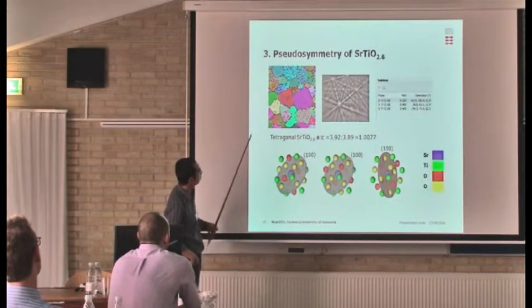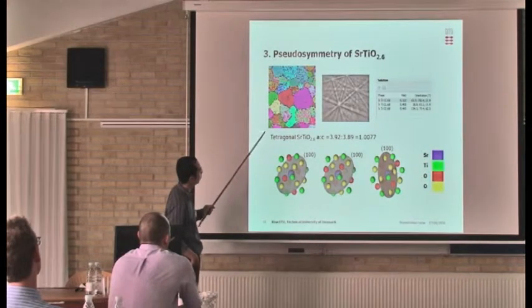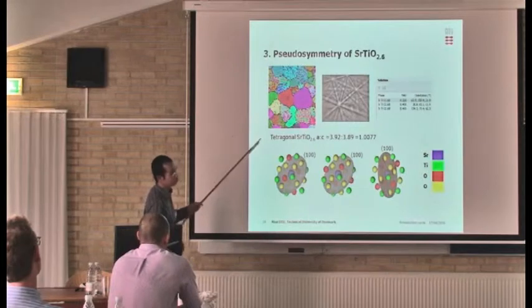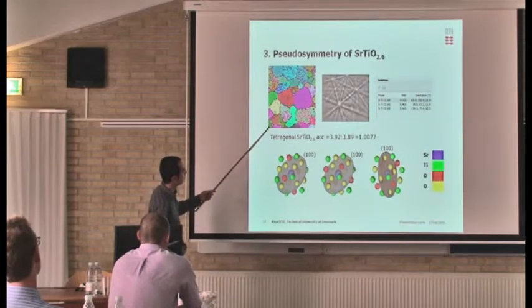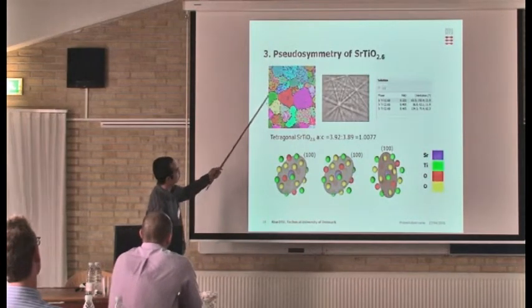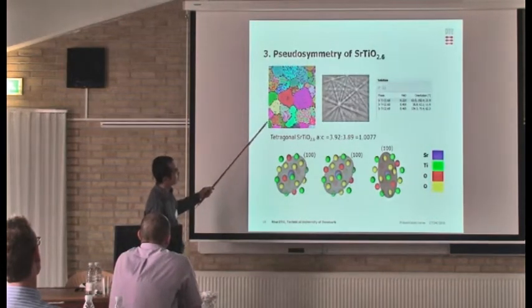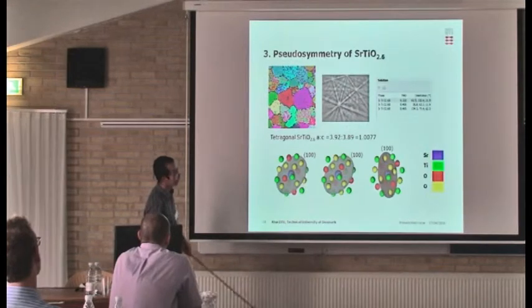For two-dimension EBSD, there is post-processing software that can correct this noise, but usually we don't have that software.